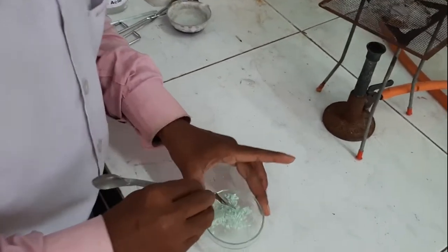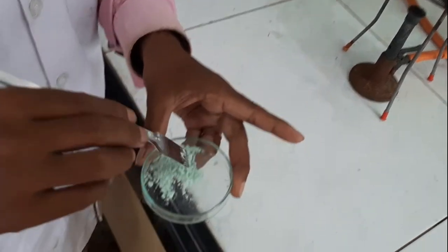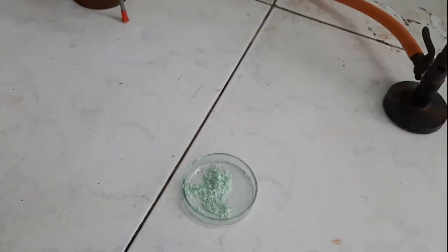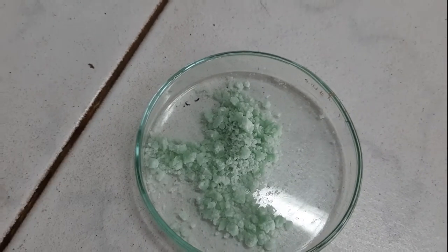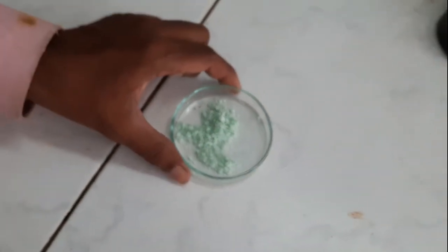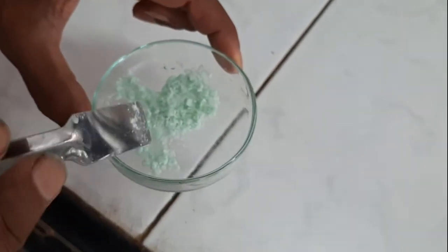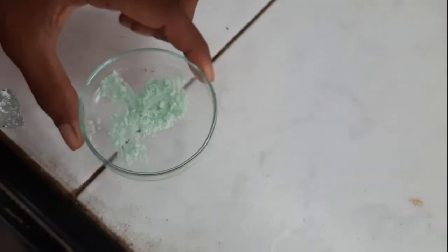Here a complete dried green colored product is obtained, which is known as ferrous sulfate crystals. We have obtained a green colored ferrous sulfate crystalline product. This is our end product — now we will weigh this product.